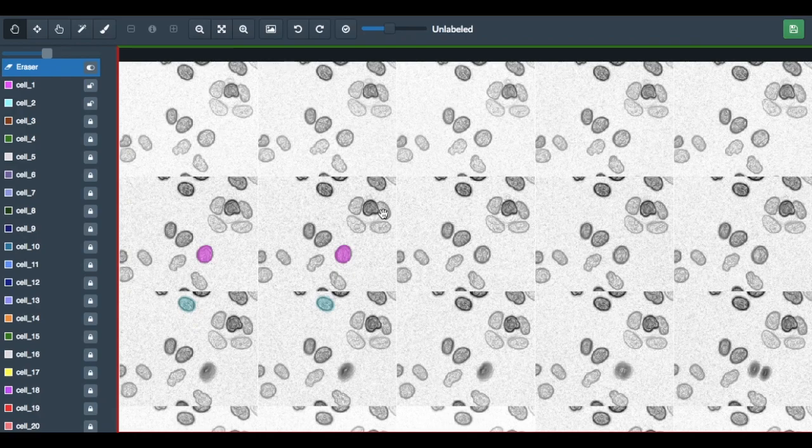Finally, we have adjusted the contrast on these images to make the cells clearer. However, this occasionally results in artifacts. Remember that cells are oval or bean-shaped, so any dark regions or cell-like objects, like here or here, are artifacts and should be ignored. After you have accurately colored all cells in an image, you're ready to submit.